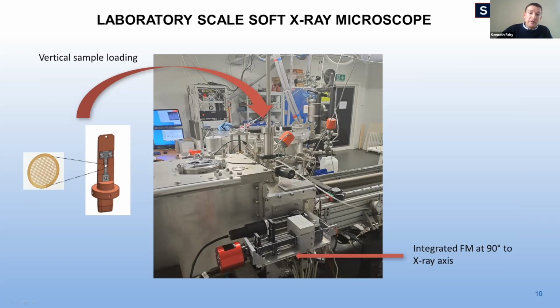Another feature worth mentioning is the standard fluorescent microscope that we've integrated into the sample chamber, which is really useful for in situ screening of the grids and selection of useful cells for X-ray tomography.